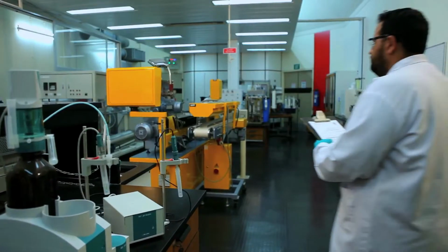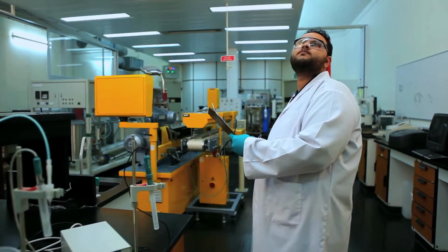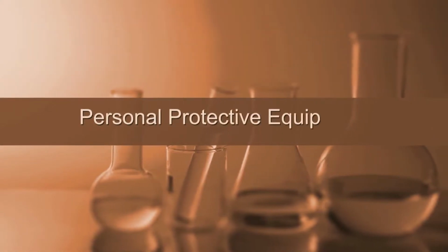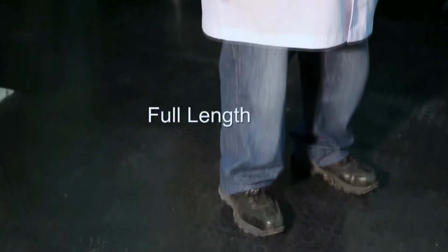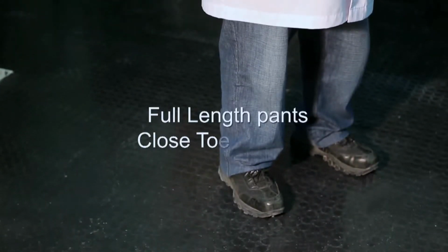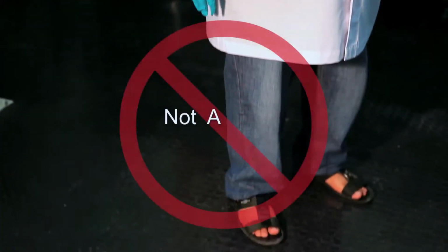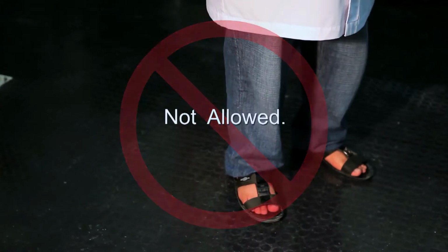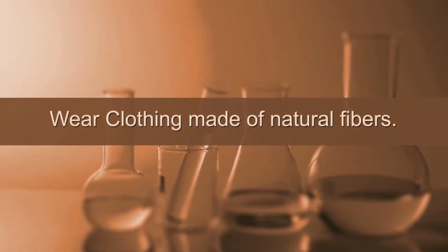In addition to recognizing hazards and evaluating your laboratory, you must take steps to protect yourself. Personal protective equipment, often known as PPE, is key to ensuring your personal safety. This starts with your clothing. Anyone entering the laboratory must wear full-length pants and closed-toed shoes. No flip-flops or any other open-toed shoes are permitted. We also recommend that your clothing be made from natural fibers such as cotton, because these materials offer better protection in the event of a fire.